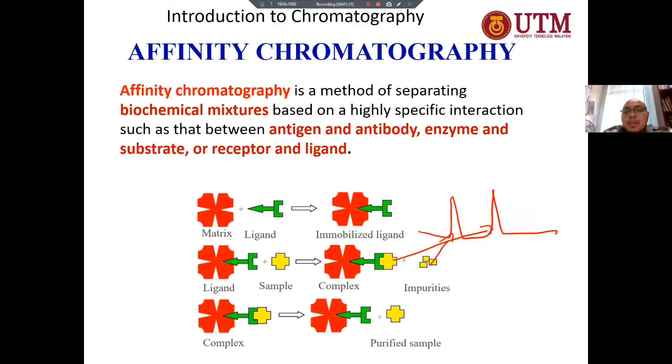So again, affinity chromatography is a method of separating biochemical mixtures based on highly specific interaction, such as antigen and antibody, enzyme and substrate, or receptor and ligand. For the definition, if you cannot remember everything, you just need to understand.